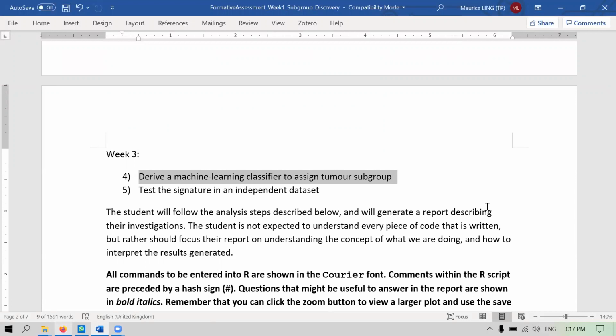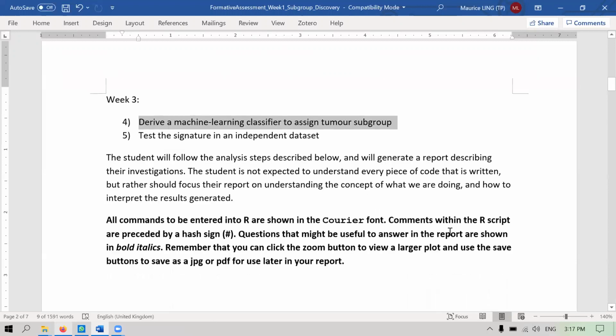So basically, using this Kuhl et al. data, we are able to classify into 4 or 5 different subgroups. We will look at it later. Can I bring in new patient data, and you tell me what stage of tumor this patient has? That's what we are going for in the third session.